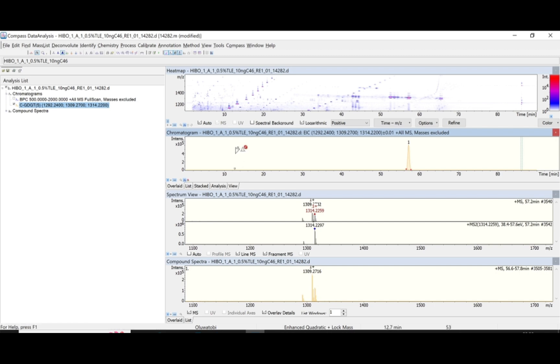What's next is to repeat these identification steps to identify the other compounds present in your sample. Once you're able to identify other compounds — whether the three-ring, two-ring, one G, two G, core hack, or whatever is present — you rename them and confirm each one with both the retention time and the mass.